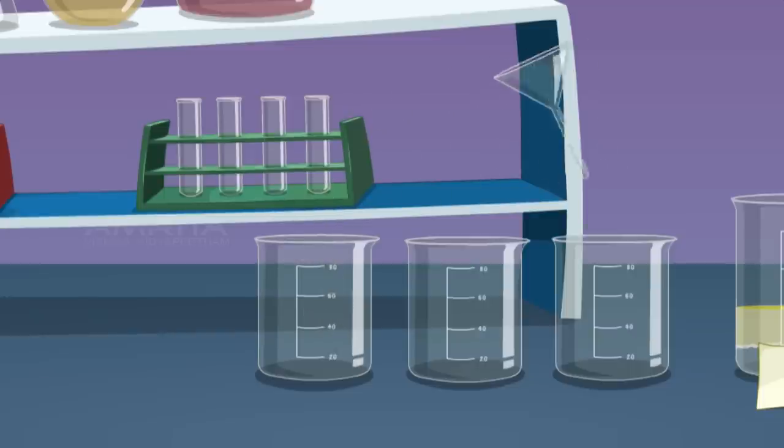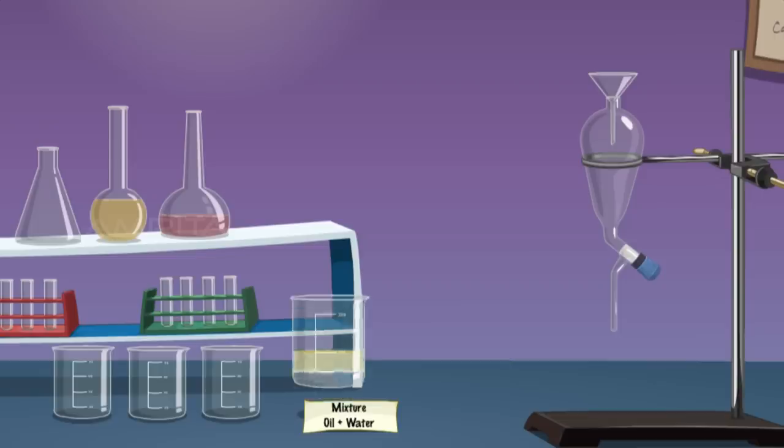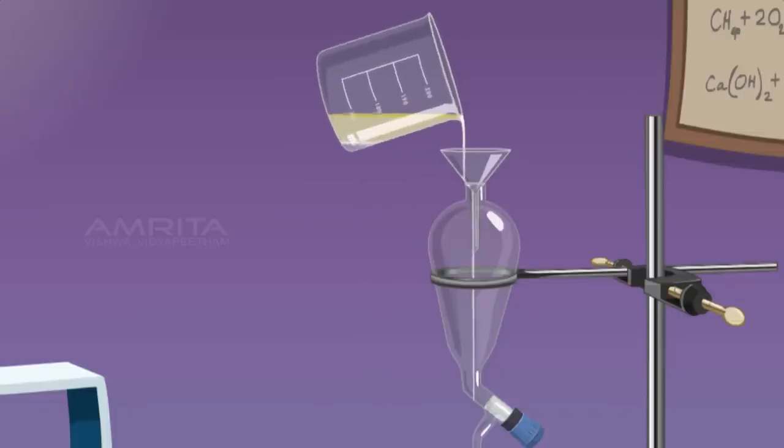Take a filter funnel and place it on the mouth of the separating funnel which is clamped to a stand. Pour the mixture of oil and water into the separating funnel through the filter funnel.